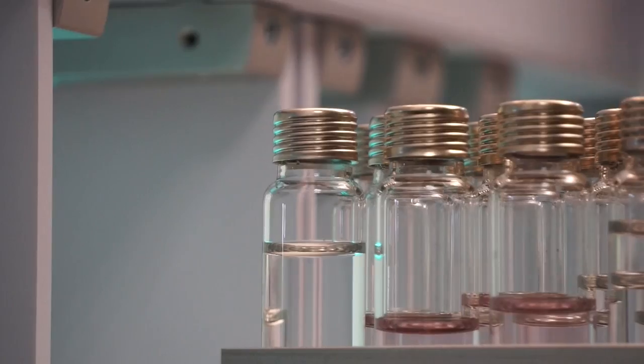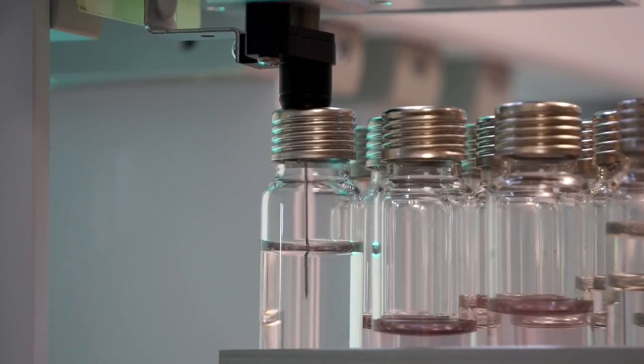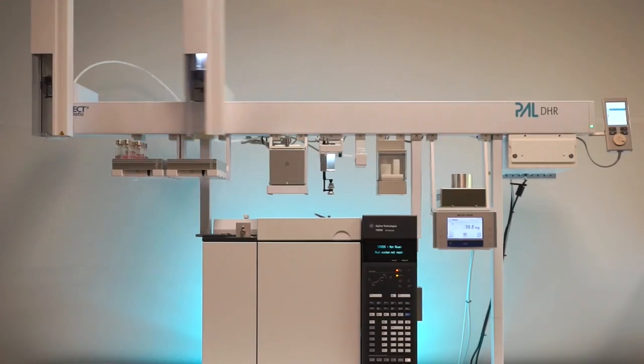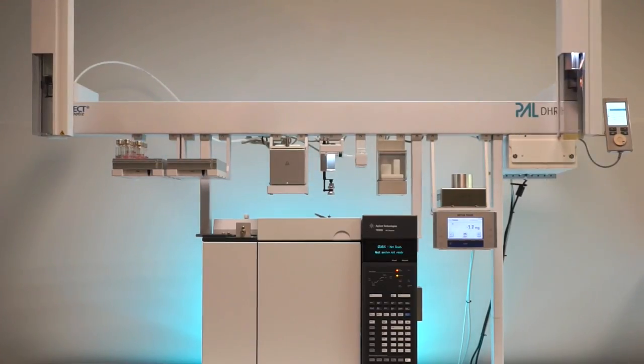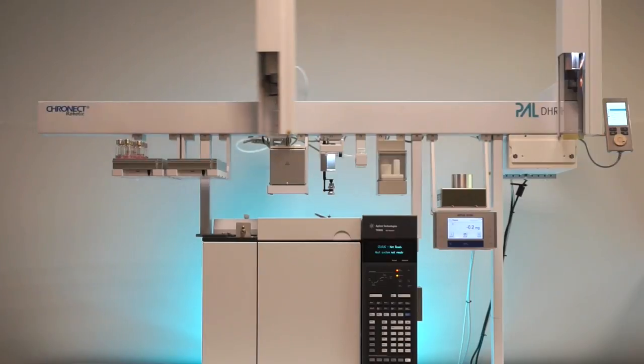The internal standard is injected into the 20ml sample vial. The vial is transported to the vortexer where the sample with the added standard is homogenized.